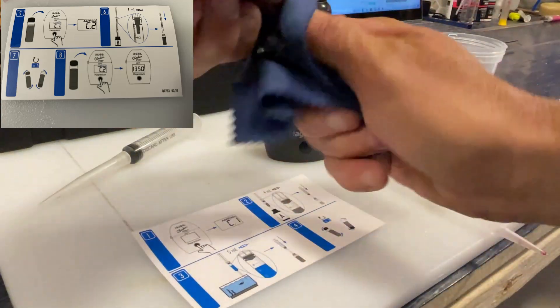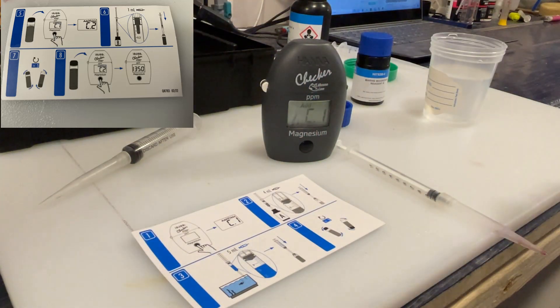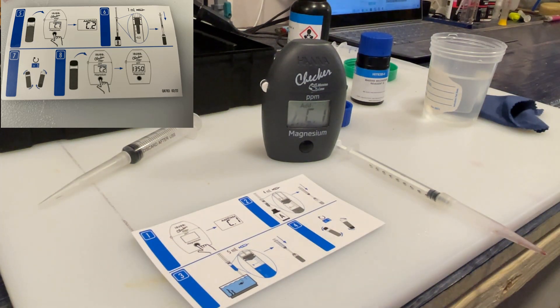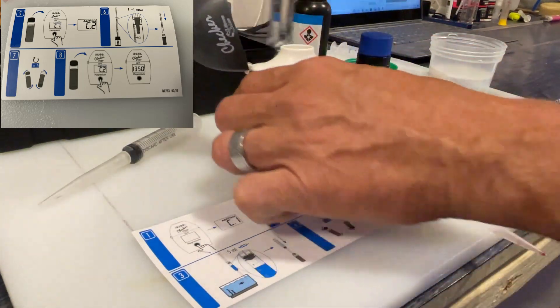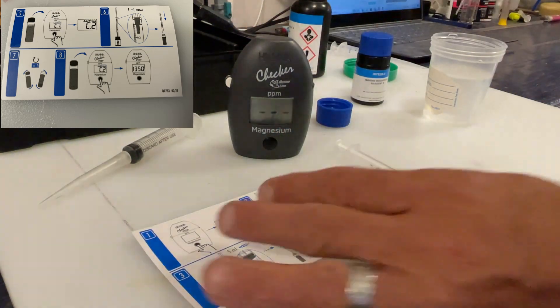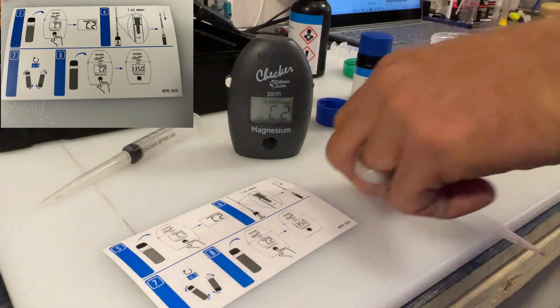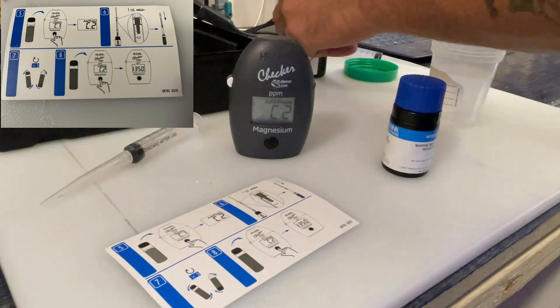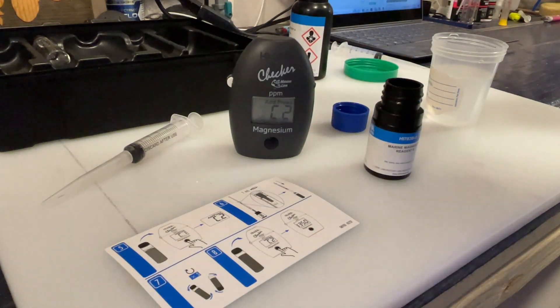Now as with any test when you're doing your salt water testing, you can have human error — it's very easy to do. So just read the directions and take your time, and everything should be good. Now take the cuvette and place it inside the Hannah checker and press the button. We have C2. Now get your 1 ml syringe and open up reagent B. Draw out 1 ml of reagent B.